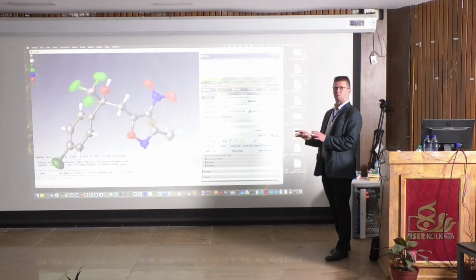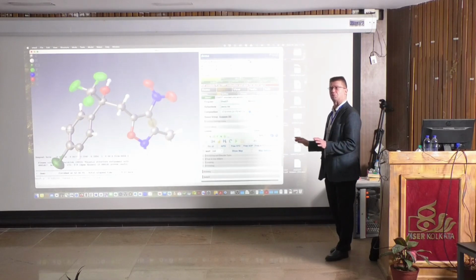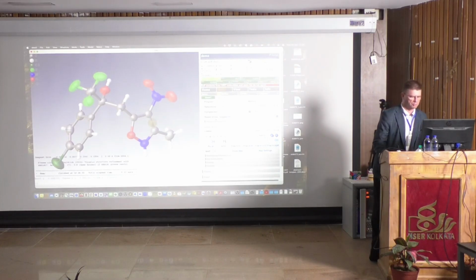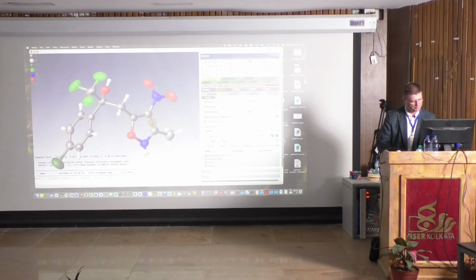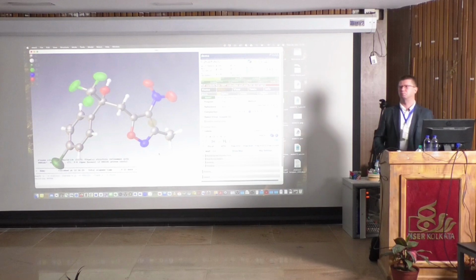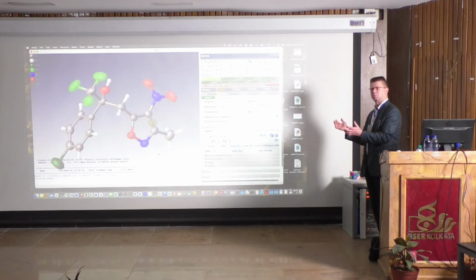So we say to the computer program that you are incorrect. So we destroy this. We just go in there and do it like this. This doesn't work so well. Delete. So I remove it.